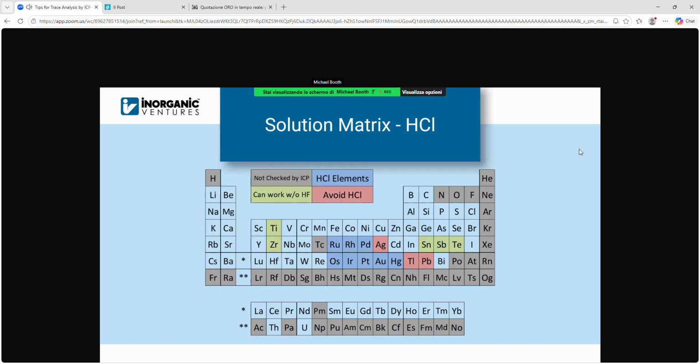And when I say excess, the general rule of thumb that we use is for every ppm of silver, 1%, the corresponding percent of HCl. So for example, silver at 10 ppm, we put that in 10% HCl, silver at 20 ppm, 20% HCl, and so on. So eventually it gets to a point where it's really not feasible because you have such a high concentration of HCl.